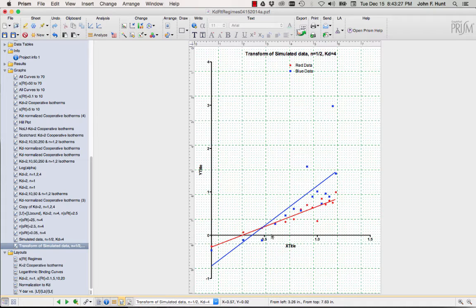And so what I would do is take the baseline value from the nonlinear curve fitting, and you see that I already took the fully saturated value from the nonlinear curve fitting. If you were to do that, you would actually get a better, straighter line for the blue data. So PRISM is doing this in a slightly obtuse way, but I think it's impractical to ask you to do those more manual analyses, especially on a test. For the moment, we're just going to live with the analysis done by PRISM, and it's not bad.